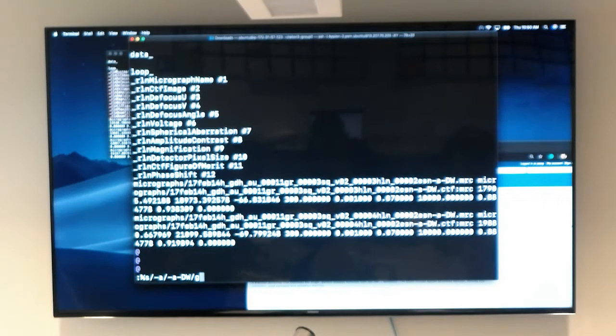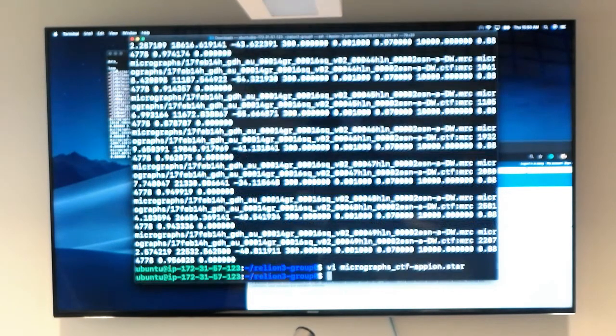Okay. There are ways around it. So you can transfer your CTF estimation in Appion to another preset, and then you can just download that star file and it'll already be in the right syntax. You can also use a text editor to do that. But what I'm really trying to tell you is that if you want to use the star file outright, you have to follow the right nomenclature that is used here. Okay, and if you don't know how to do this, we can go over this during your practical free time. Okay, so because of this, I'm going to try to preserve that naming structure. If I don't like that naming structure, then I'll just update the star file to the structure I would want.